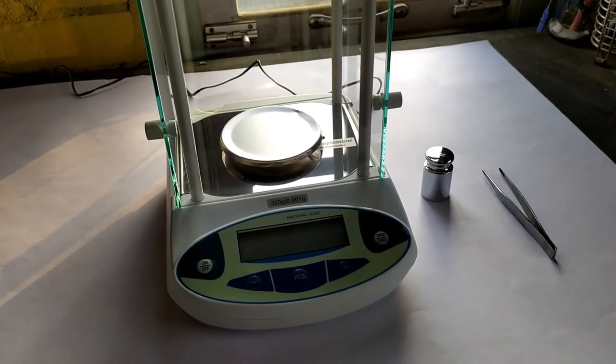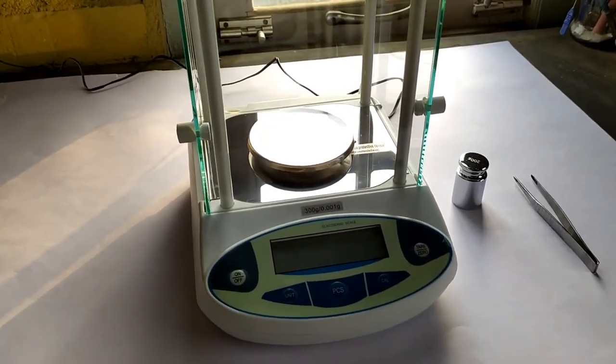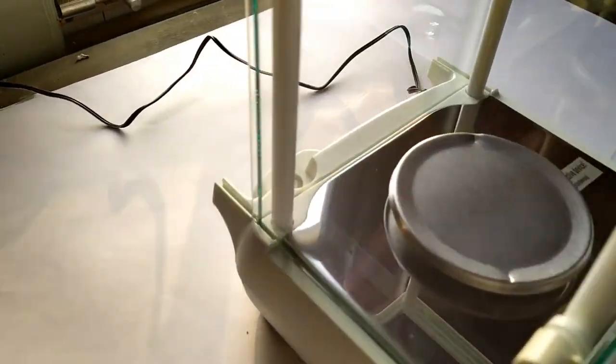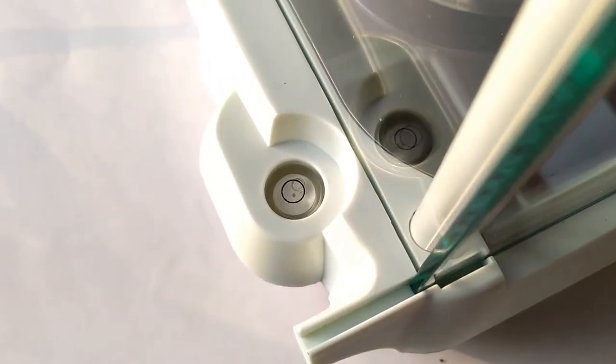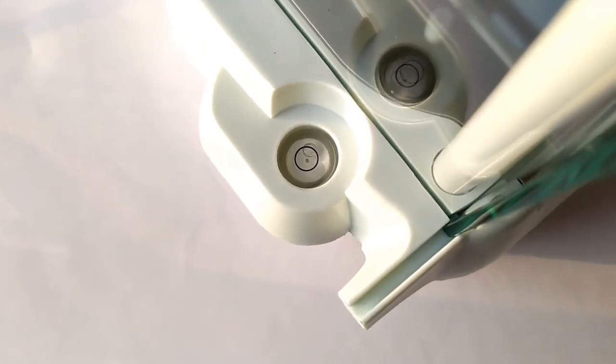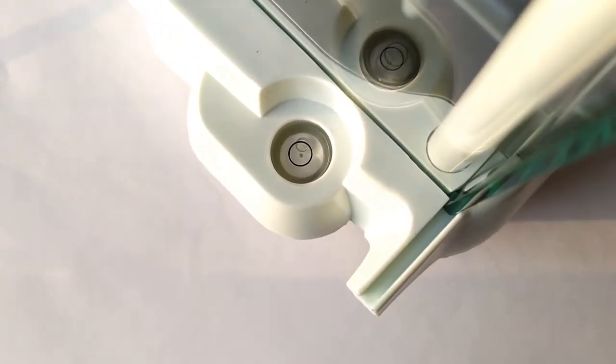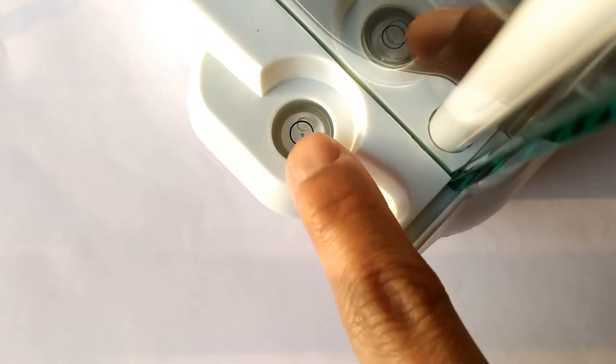In order for a digital weighing scale of this level of sensitivity to be operated, the device has to be in a perfectly horizontal level. We achieve this leveling using the liquid leveling gauge usually located behind the weighing scale. In this regard, the unit that I received has a huge manufacturing defect.